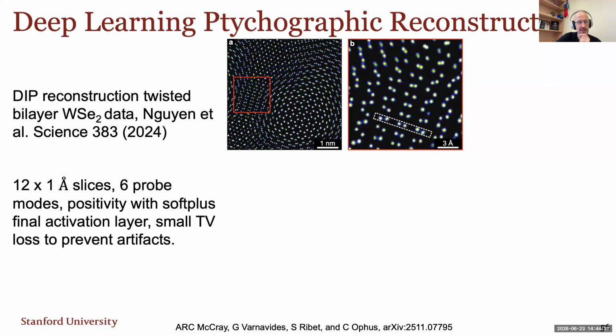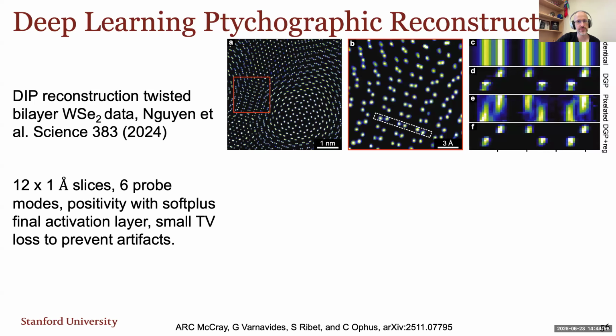And when you do multi-slice electron ptychography, you can calculate that the resolution along the beam direction is going to be somewhere in the range of 1 to 4 nanometers. And for a standard sample, 20 nanometers thick, 2 to 3 nanometers is pretty typical. But for a 2D material like this, you want to be able to hit that lower limit, that 1 nanometer resolution along the beam direction.